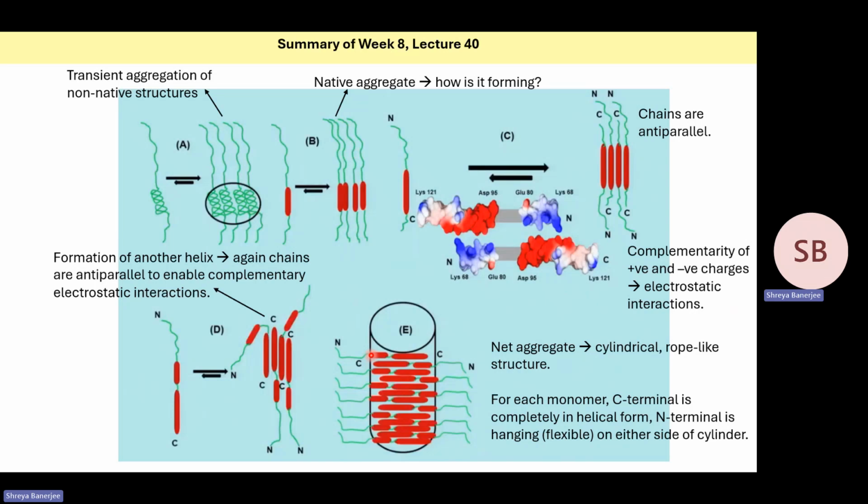These flexible portions are the ones where you will be able to see the NMR irrespective of the DMSO conditions, because they are not part of the aggregate; it is a flexible region. So the NMR of these flexible tails will always be visible. But the regions incorporated inside the rope form part of an aggregate. So they will have a very large tumbling time, and so they will have very large line width, and you will not be able to see these signals.